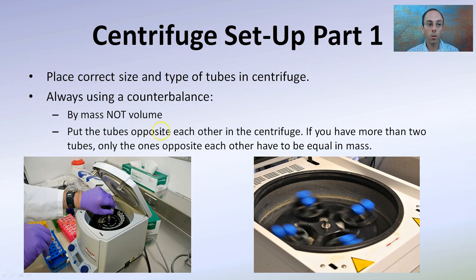When setting up a centrifuge, you want to place the correct size and type of tubes in the centrifuge — some are specifically made for the high rate of spinning. You always want to use a counterbalance, and the counterbalance is by mass, not by volume.